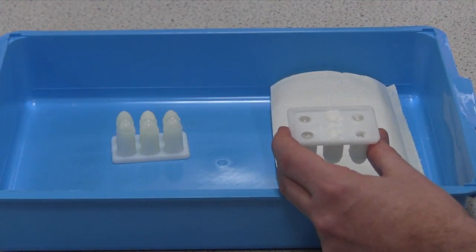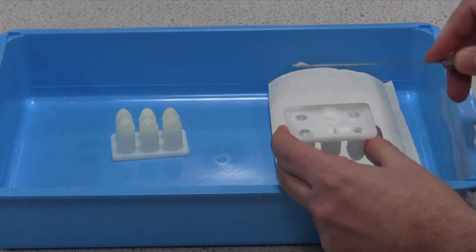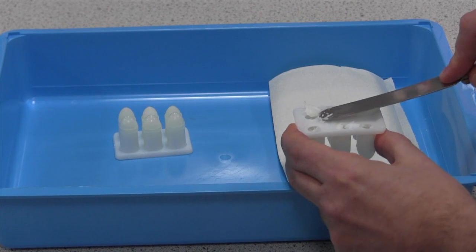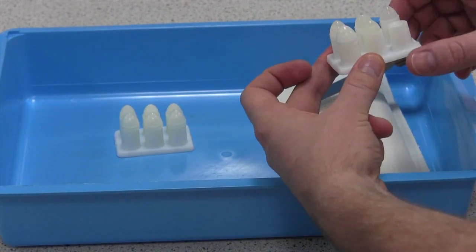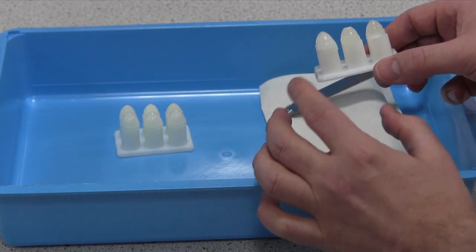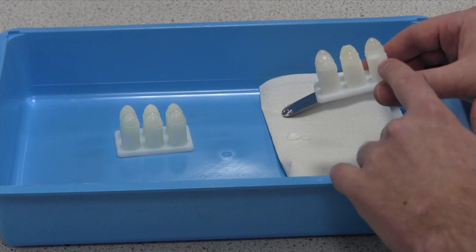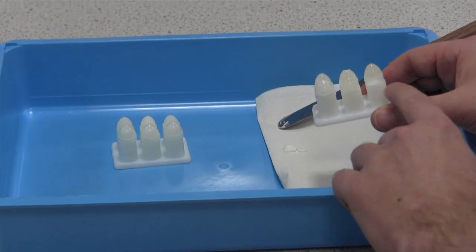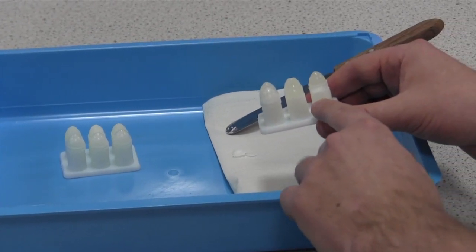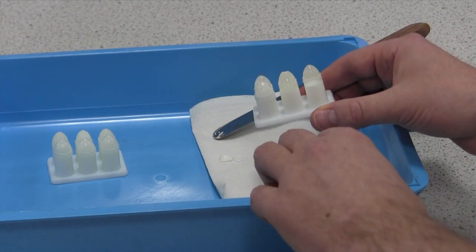Having poured your suppositories and allowed them to settle and cool — but not get completely cold — you need to scrape the excess off the top. As you turn it over, you can see some of the caps we've already removed. Here you can see where we've been a bit too strong and broken the end of the suppository off — that's not acceptable and won't be included in any suppository that we release.